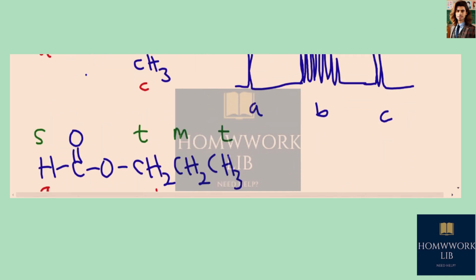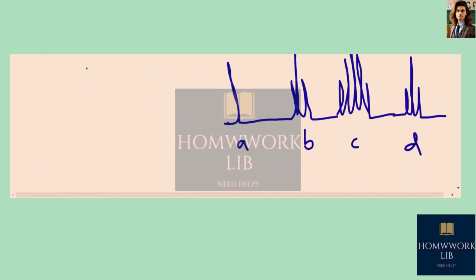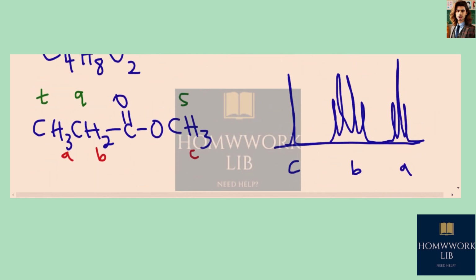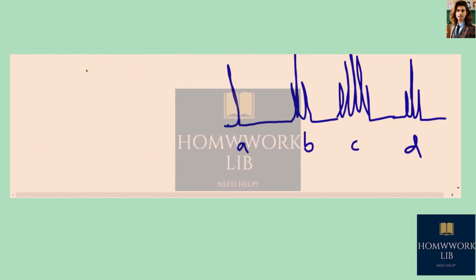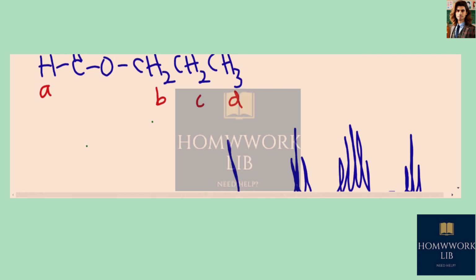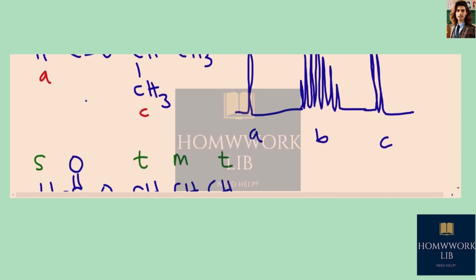So the final 2 esters that we looked at have singlets as their most downfield signal, but the final ester has 4 signals instead of 3, so we can distinguish between the latter 2 esters.